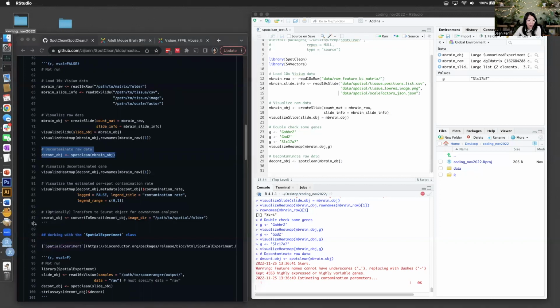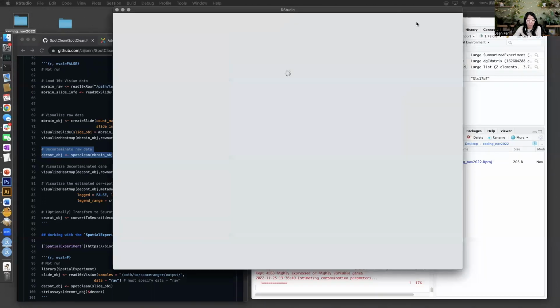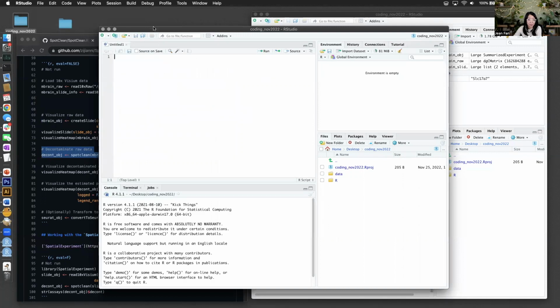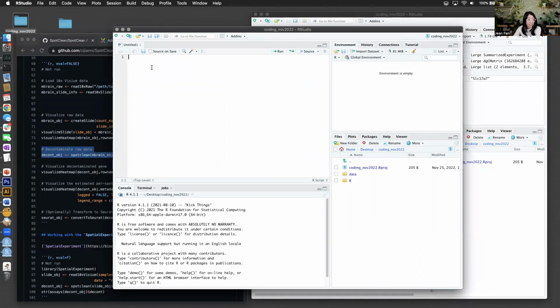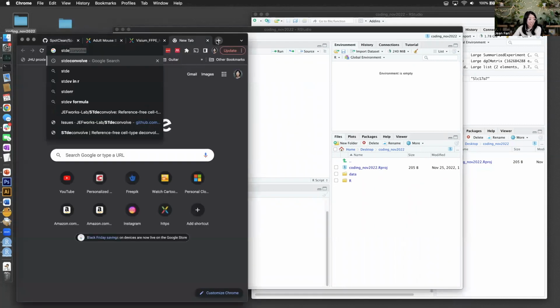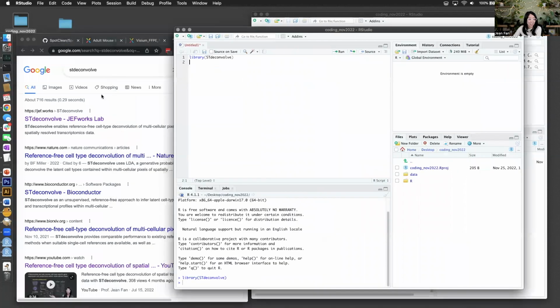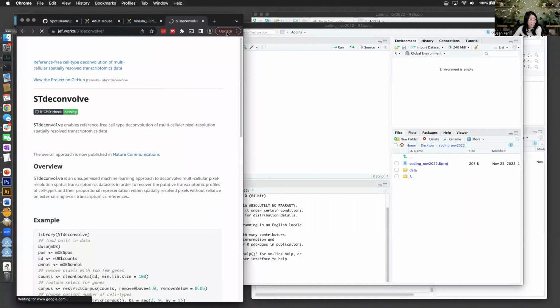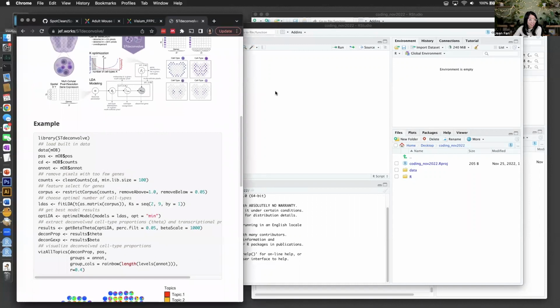Okay, I'm actually going to start up a new RStudio session just so that we can maybe explore some other stuff in the meantime. Yeah, so the other part of this is the reason we're pursuing this is to see if it could work in conjunction with STdeconvolve. So maybe we should just try to run STdeconvolve and see what that looks like with and without the SpotClean. Well, that could be fun. That would be what we would do anyways if we were trying to evaluate and compare.